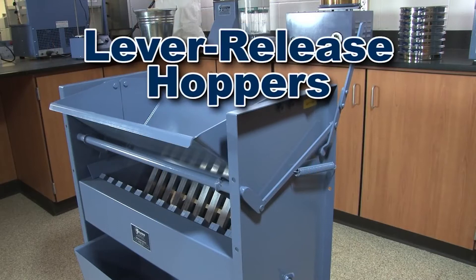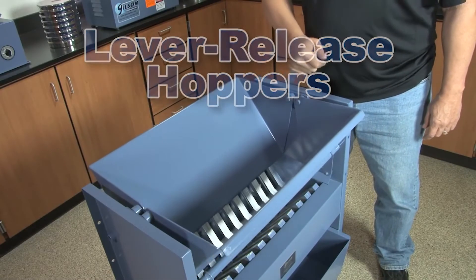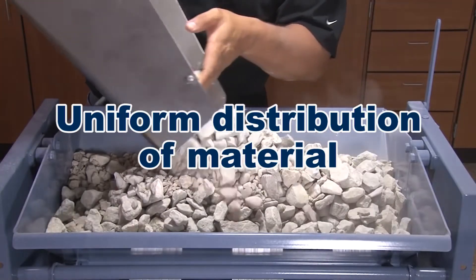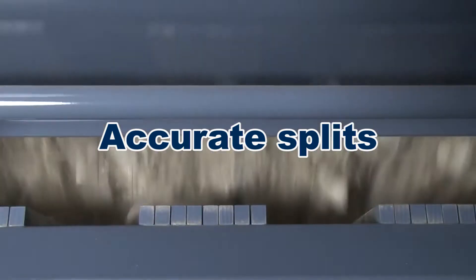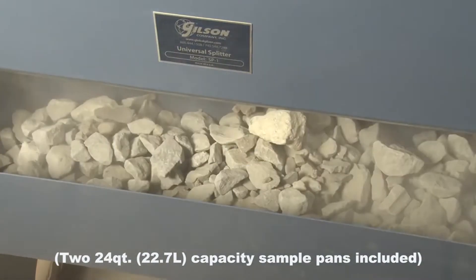Lever release hoppers of the Universal Splitter remain closed until the bulk sample has been fully loaded and evenly distributed. This assures uniform distribution of material through the chutes, more accurate splits, and requires only two sample pans for proper operation.